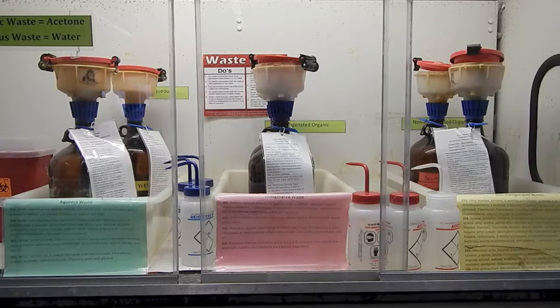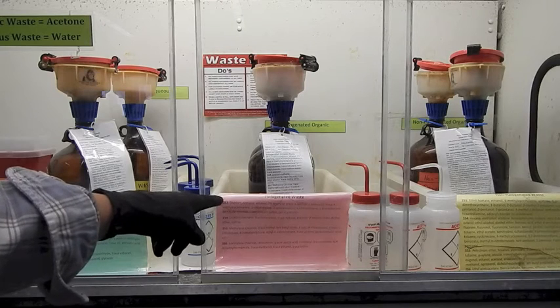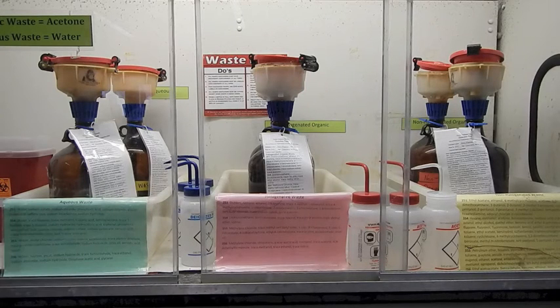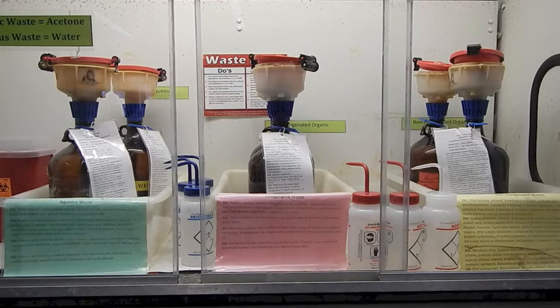If we have halogenated organics, they're going to go in the middle jug here, the halogenated waste. So that's halogenated organic waste, things like methylene chloride will probably be the most common one that we use. Anytime you see a halogen, so chlorine, bromine, things like that. And on the left hand side we've got aqueous waste. This aqueous waste is for water-based things that are primarily made of water, salt solutions, things like that. So I'll try to help you out as we go through on telling you where the waste should go.